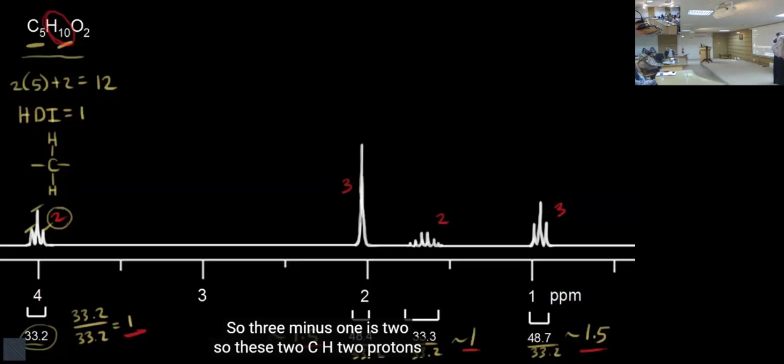So we can now come back here. Which one do we fit in? Either this or this. Now the reason why this is the more correct one is because the two proton triplets at chemical shift 4 are highly deshielded because of this. So this is more.